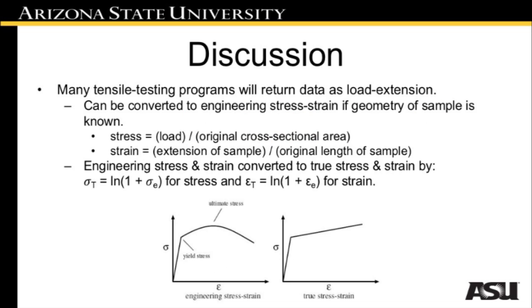Here we display some of the equations for converting the output data from a tensile test to a universal format that can be communicated in a standardized form, without your audience having to know the dimensions of your samples.